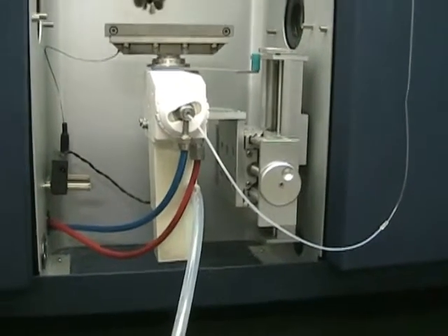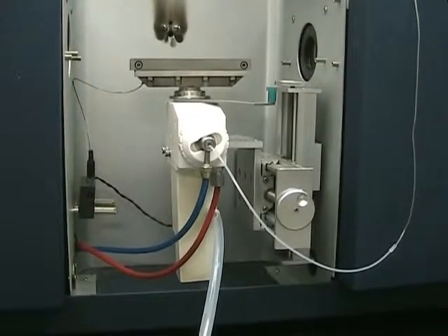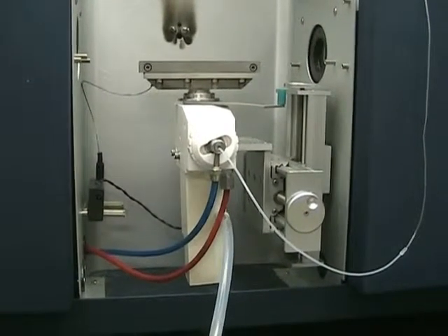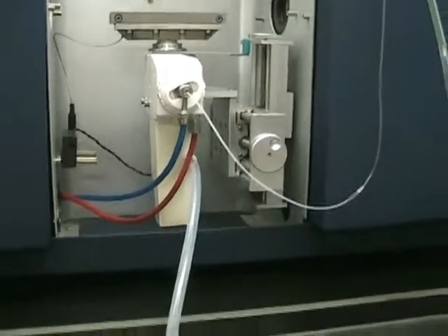Also on this unit, we noticed that the stepper motor on some of the mirrors in the back — one stepper motor anyway — had some noises coming from it, so we are replacing that as well. But we do have this unit set up and ready to go.